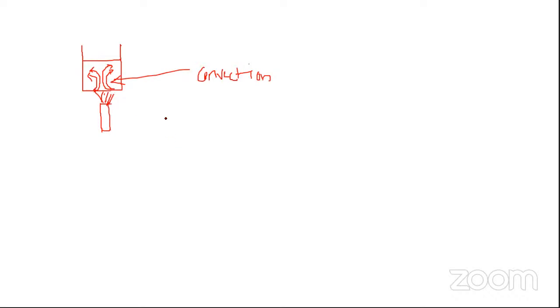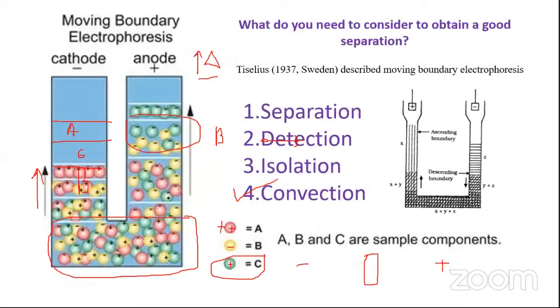So what is actually happening inside the beaker? If you visualize, the molecules are moving away. They get cold enough because they are losing their heat as they strike other stable molecules. Once they lose their energy, they come back down and get heated again. And this cycle continues till the entire solution gets to the same temperature value. Now the problem with this process is that it is setting molecules of solvent in motion. And that is the problem here.